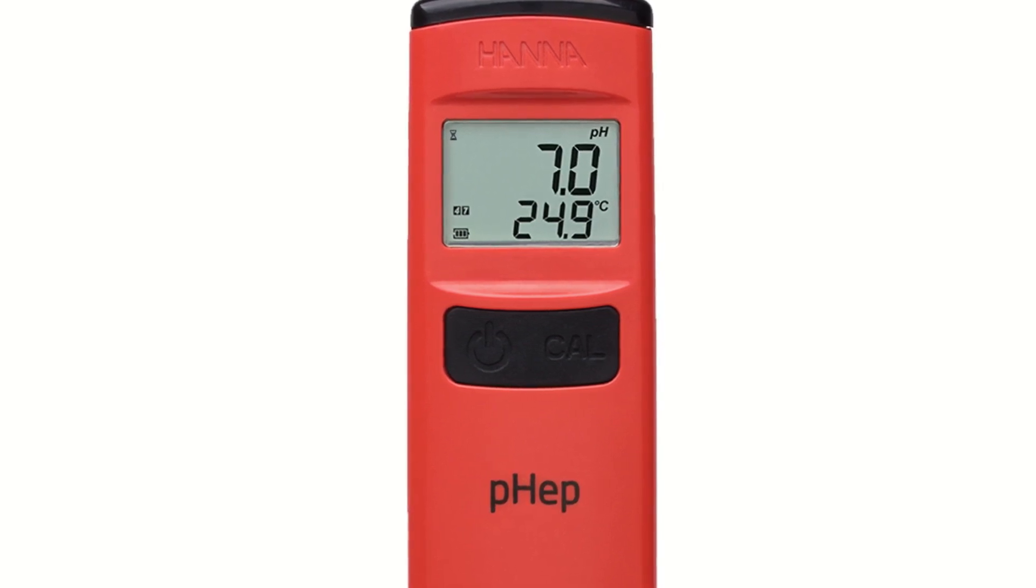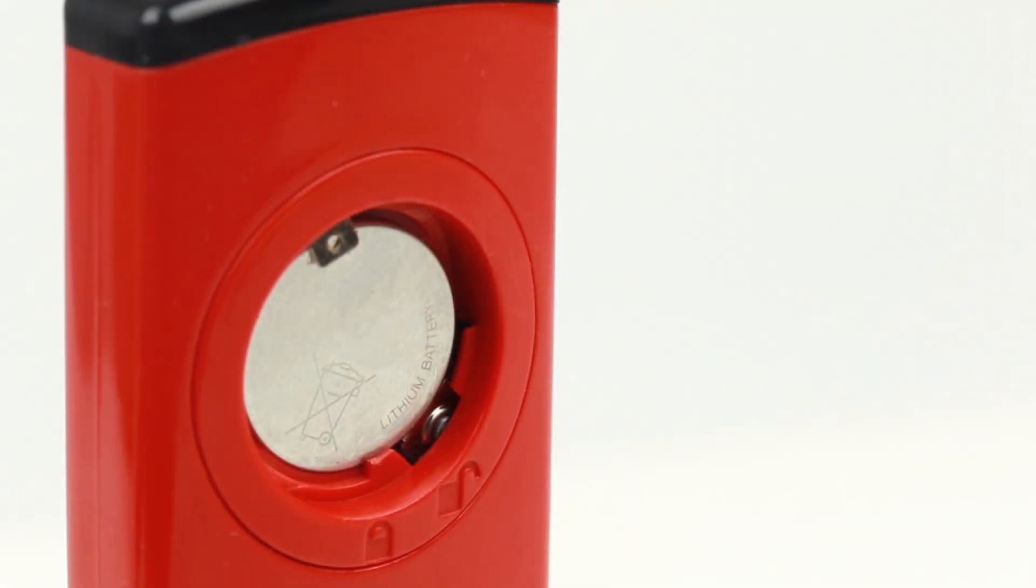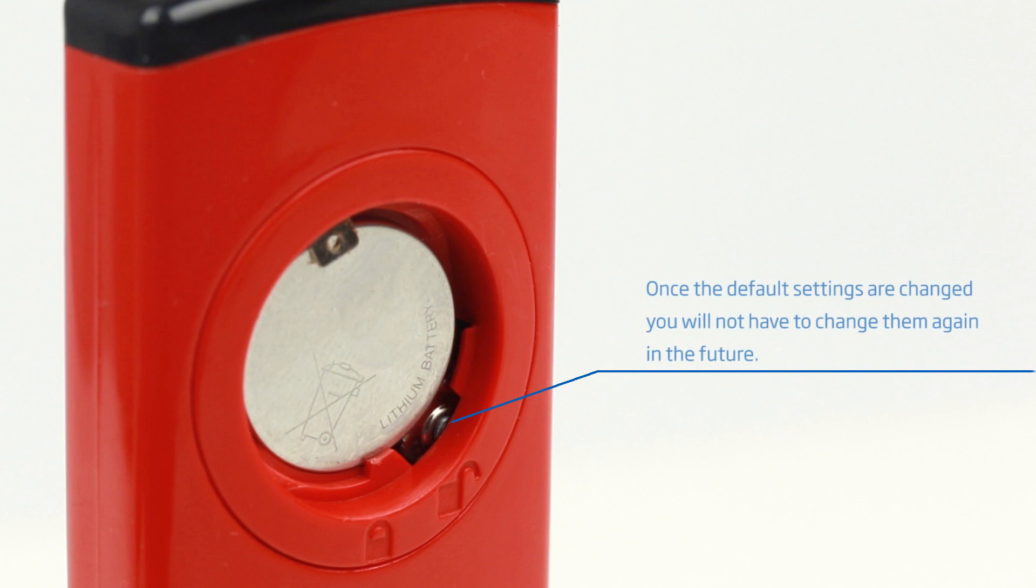The daily operation of the meter has been simplified to just two buttons. One is for turning the meter on and off, while the other is used to enter calibration mode. There is a third button in the battery compartment that allows the user to choose the displayed temperature unit and adjust the automatic shutoff time.